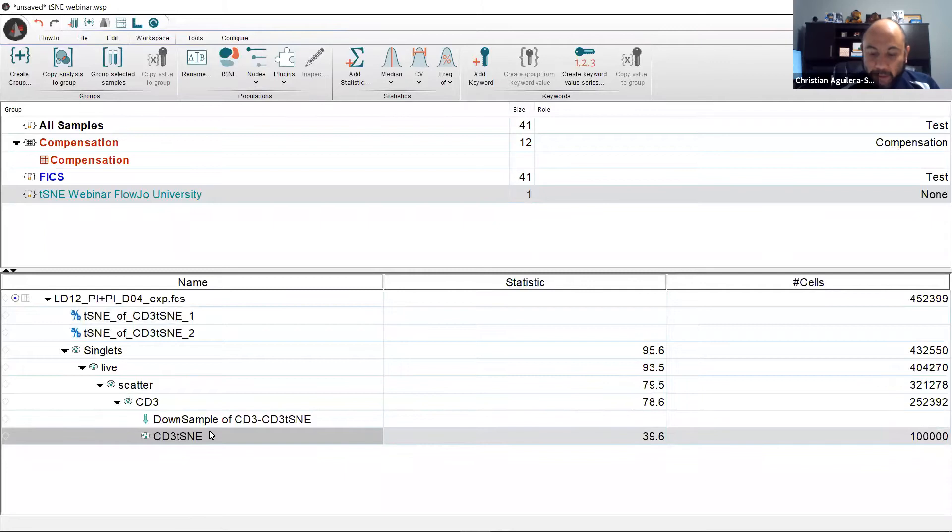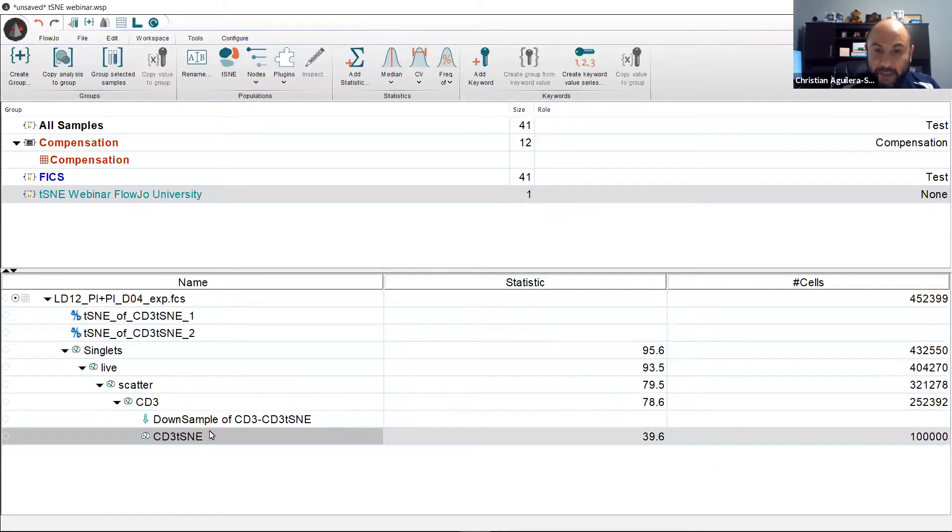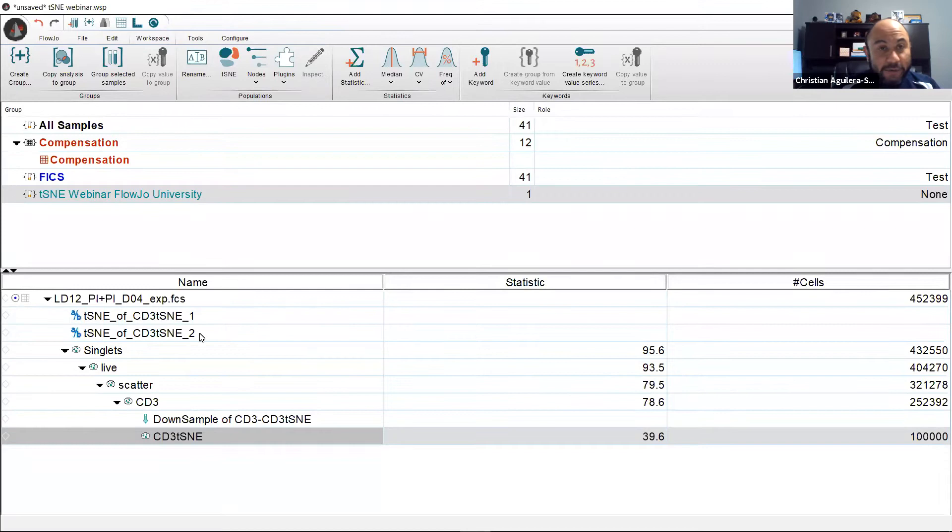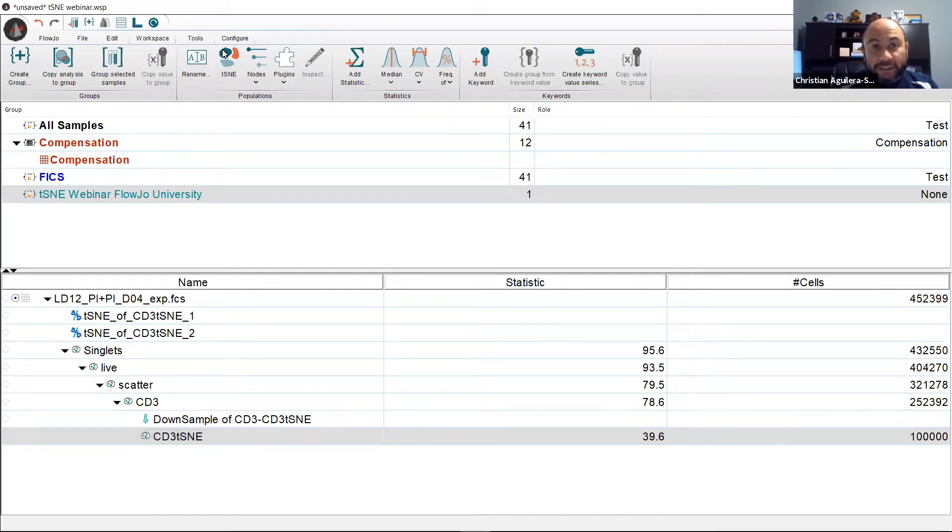First we select a population we wish to explore further using the t-SNE space. In this data set I want to interrogate the different T cell subsets within this sample. Next we click on workspace followed by our t-SNE button.